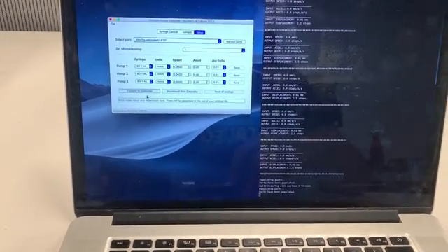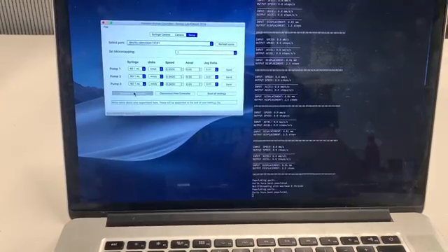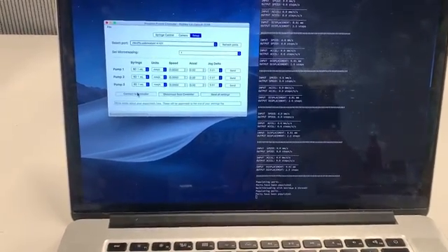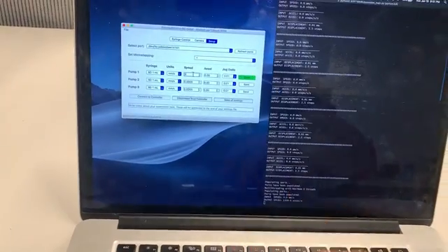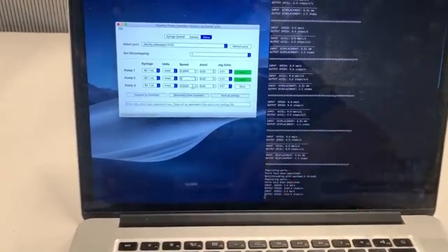Once that's done, we'll go ahead and press Connect to Controller. So we're connected to our controller, and now we're going to put in some speed and acceleration values just to test things out. For our test, we'll do five millimeters per second on all of them.